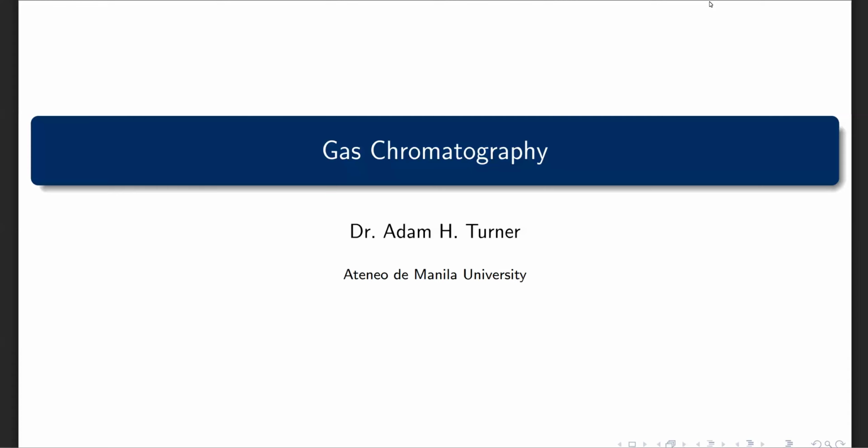Welcome to this lecture on gas chromatography, or GC. In the previous lectures, we built the theoretical foundation and applied it to HPLC. Today, we will apply the same principles to GC, where the mobile phase is a gas rather than a liquid. This single difference has profound consequences for instrumentation, column design, and the types of analytes we can analyze.